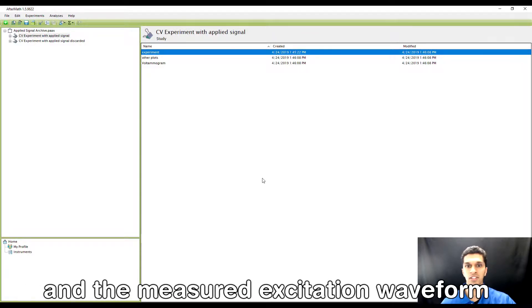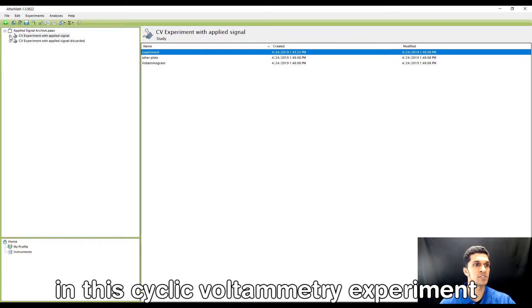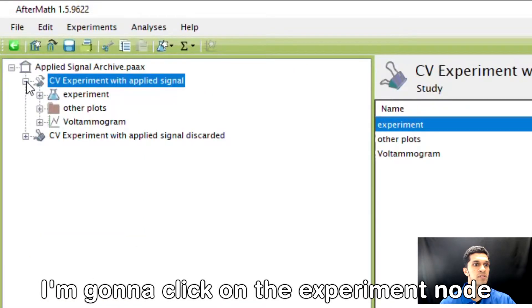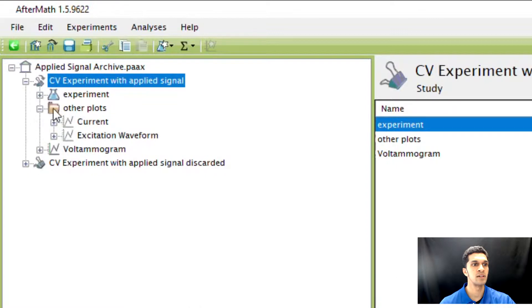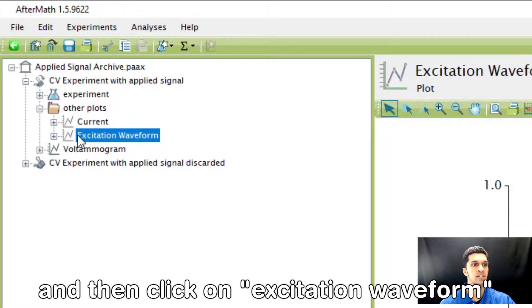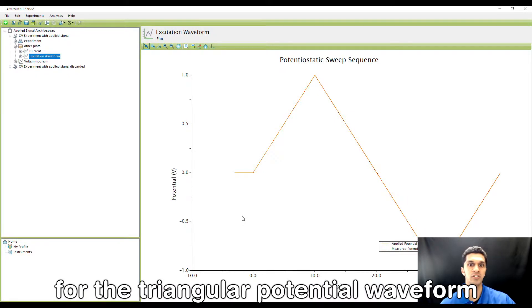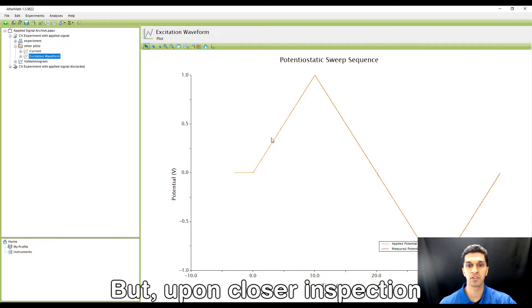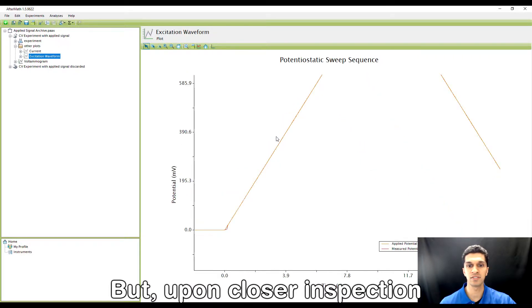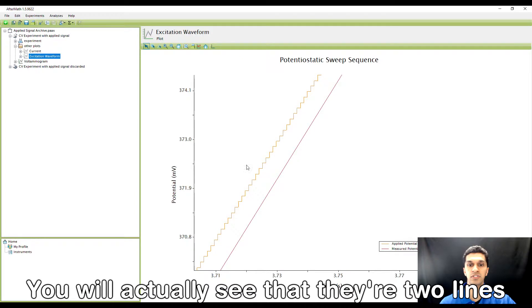When you perform an experiment, Aftermath automatically saves the applied and the measured excitation waveform. For example, in this cyclic voltammetry experiment, I'm going to click on the experiment node, then go to other plots and click on excitation waveform. Now it looks like I have one line here for the triangular potential waveform with cyclic voltammetry.